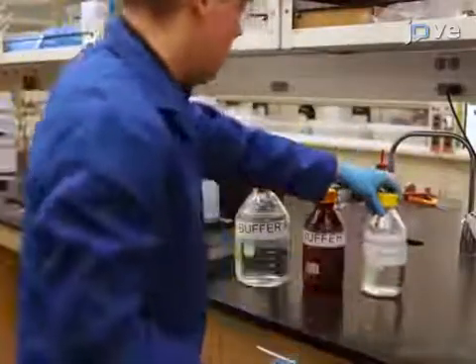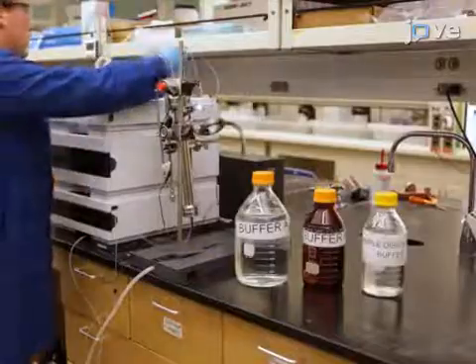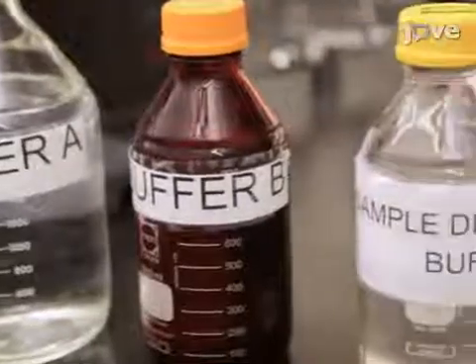For this HPLC protocol, have prepared stocks of buffers A and B ready, as well as the buffer for sample dissolution.